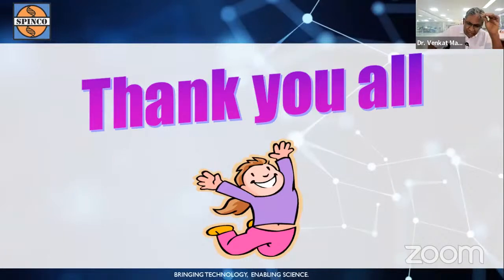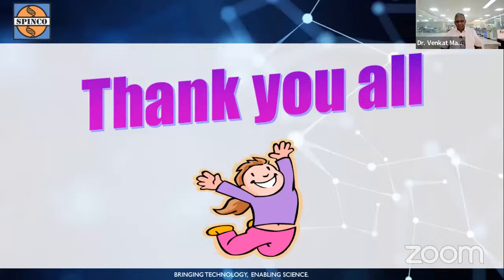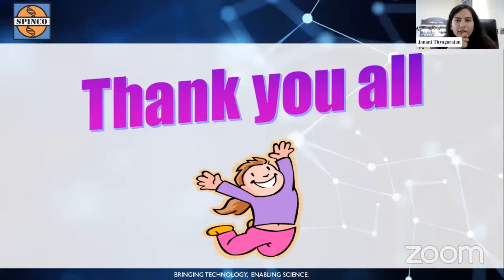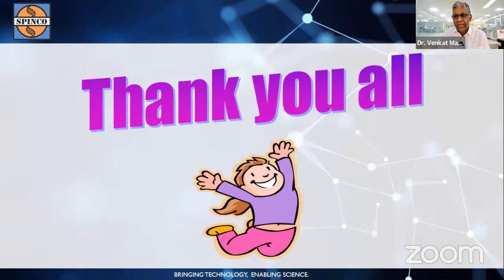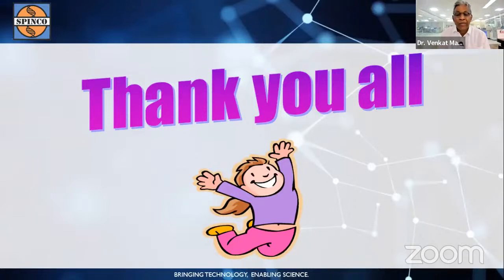A lot of this comes for the next session. How can we identify the main mass peak in a mass spectrum if there are a lot of peaks? Next session. Please describe the difference between hard and soft ionization in few words, I'm a little confused. Soft ionization is one where you are able to see the molecular ion intact. Hard ionization is one where you are not able to see the molecular ion.